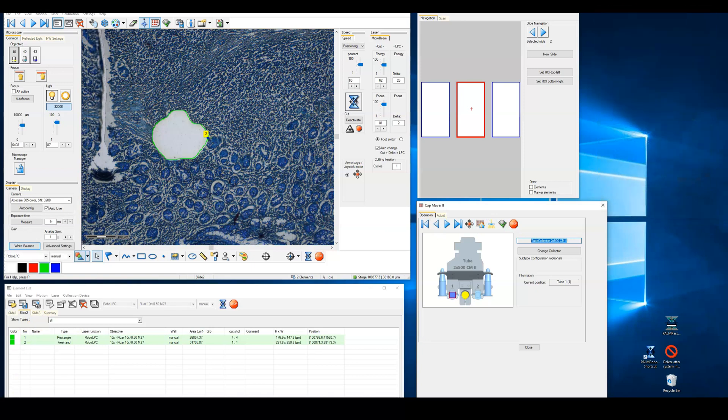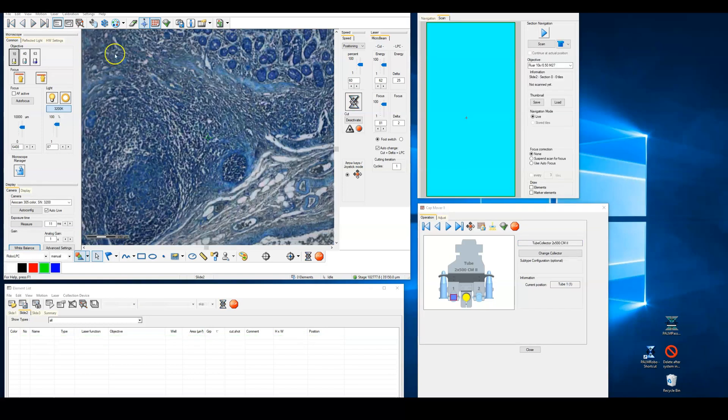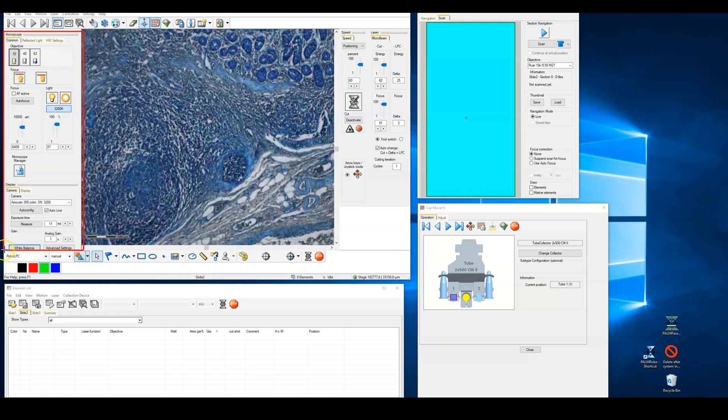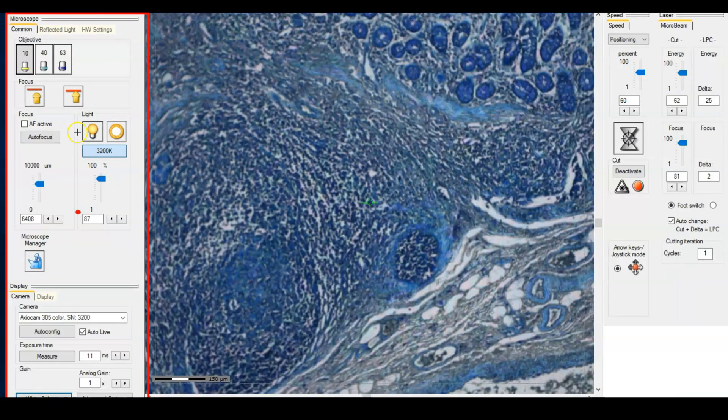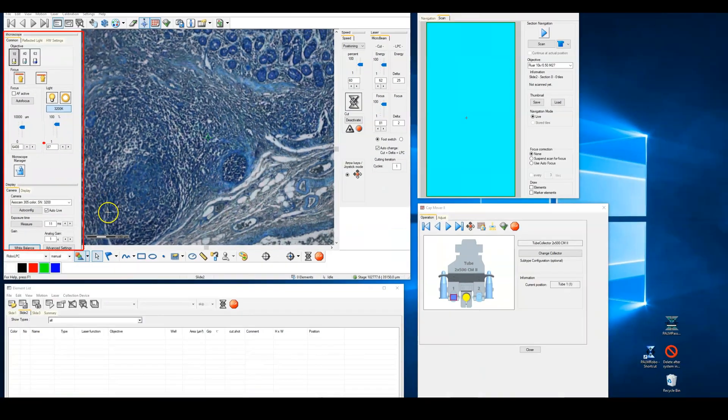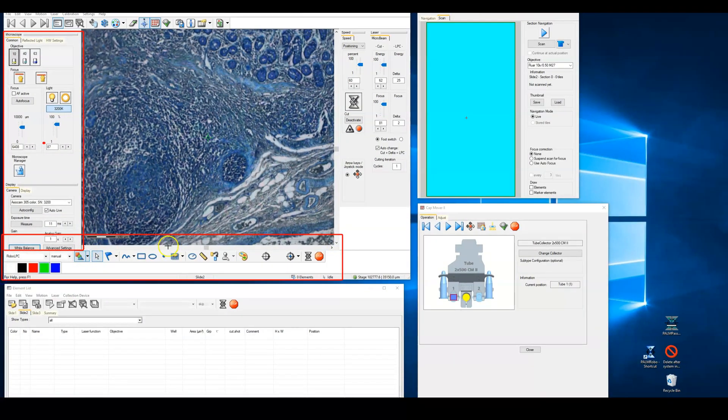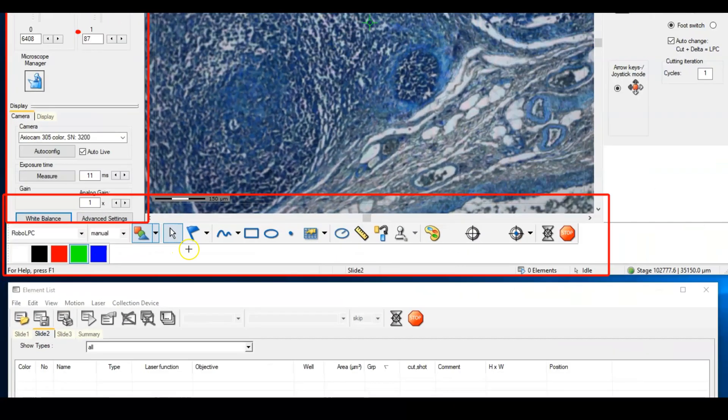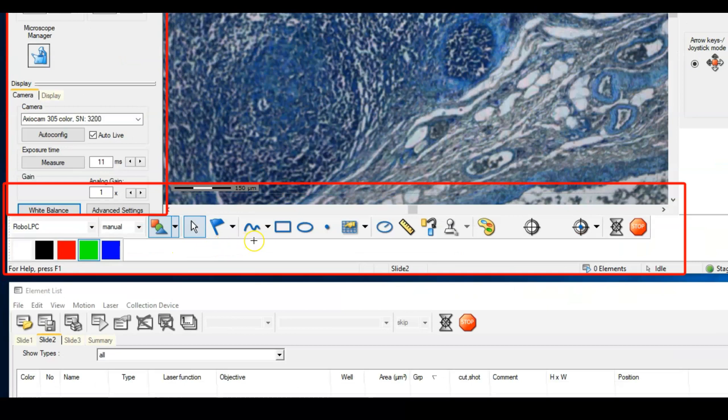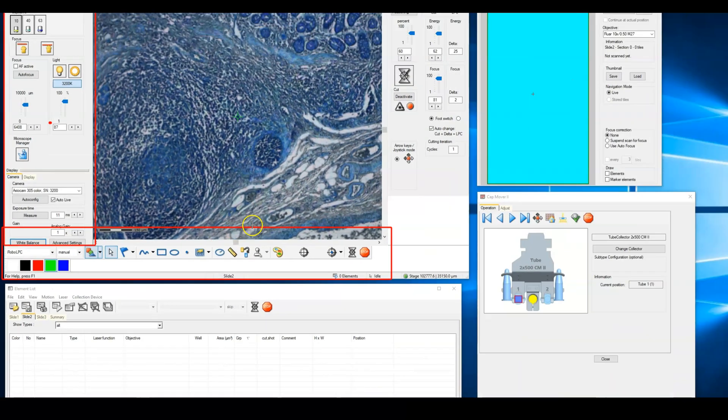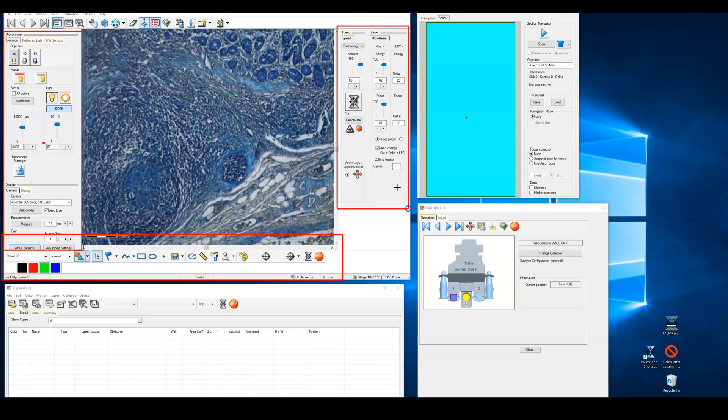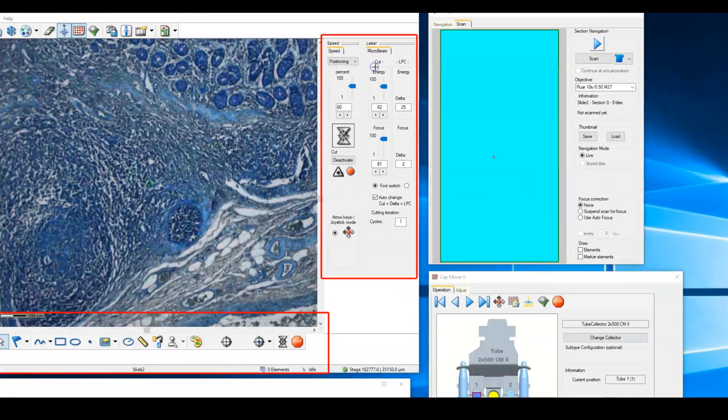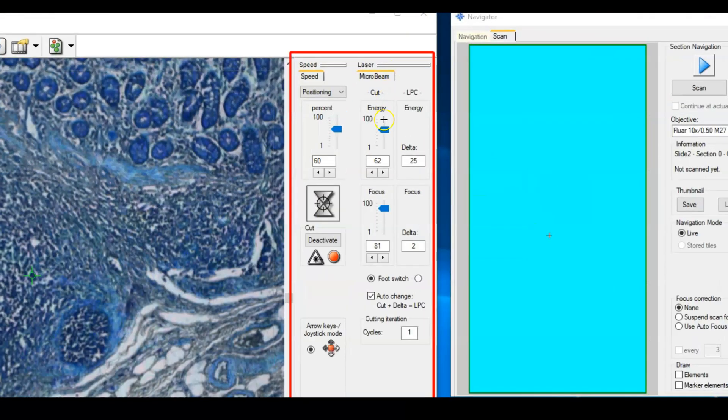Now that you understand what to expect with the laser capture micro dissection, let's take a few steps backwards and walk through the software interface and how to optimize the laser capture process. To the left side of the main window you will see the microscope and camera controls. Below the live image you see the drawing controls for identifying regions of interest that you would like to isolate from the sample. On the right side of the live image you see the controls for your cut laser power and focus. We will discuss these cut laser controls in more detail shortly when we optimize the laser cutting.